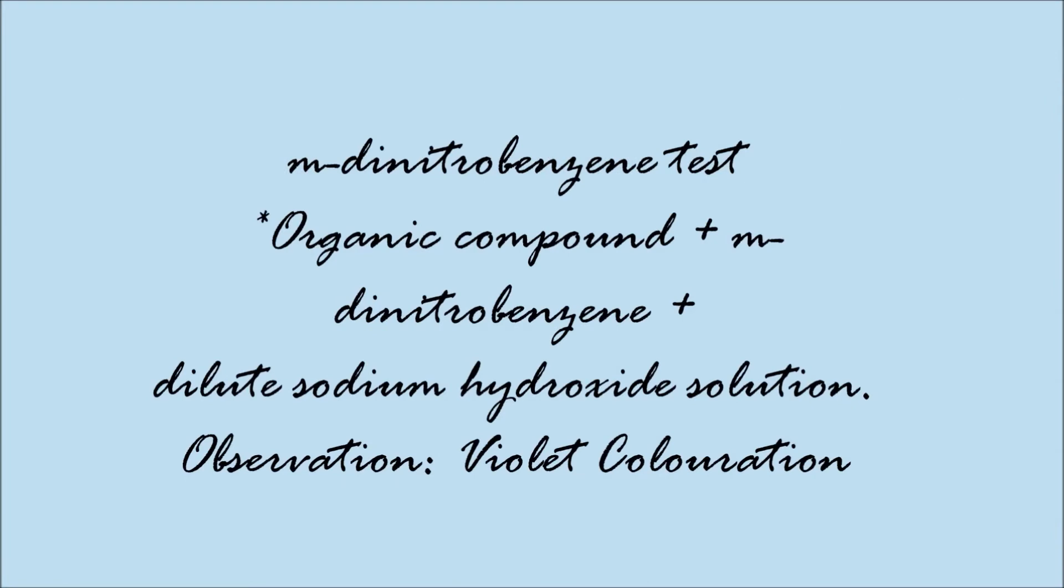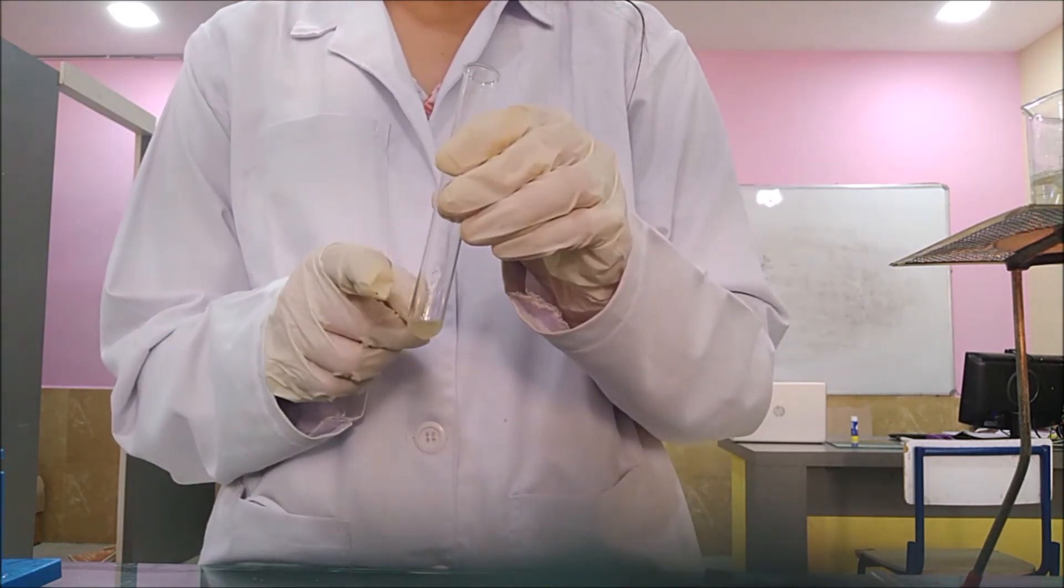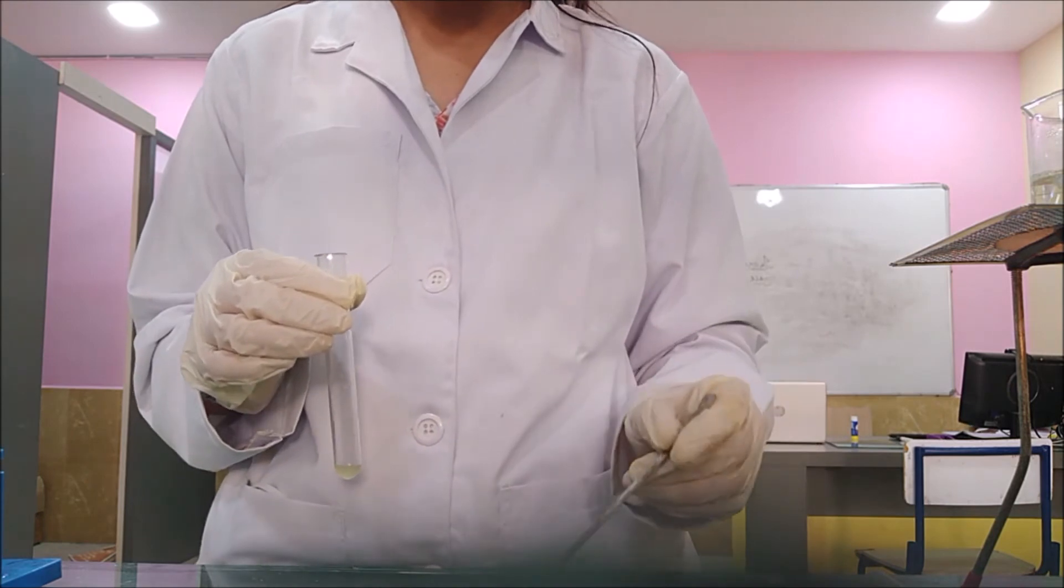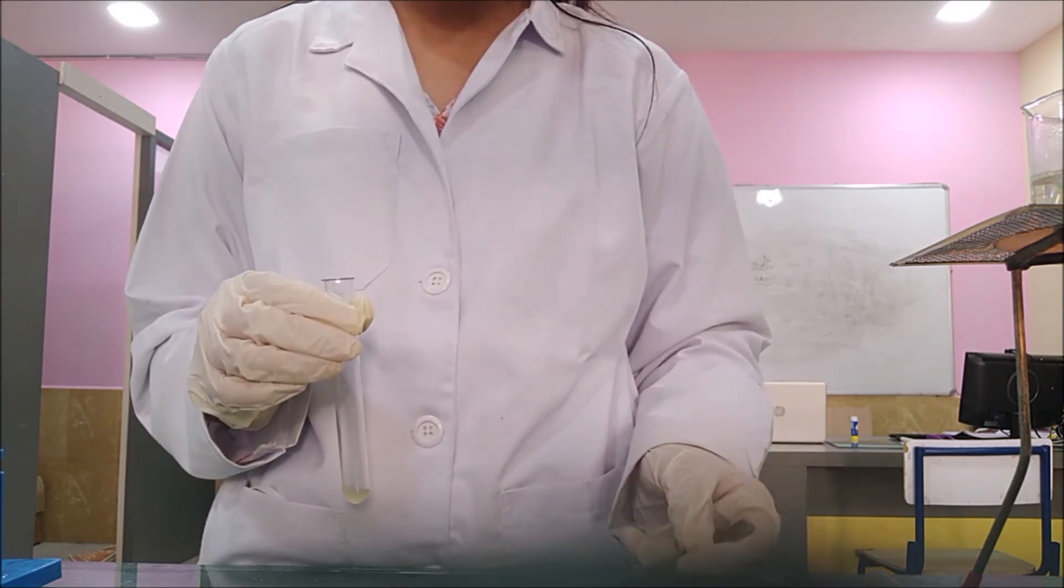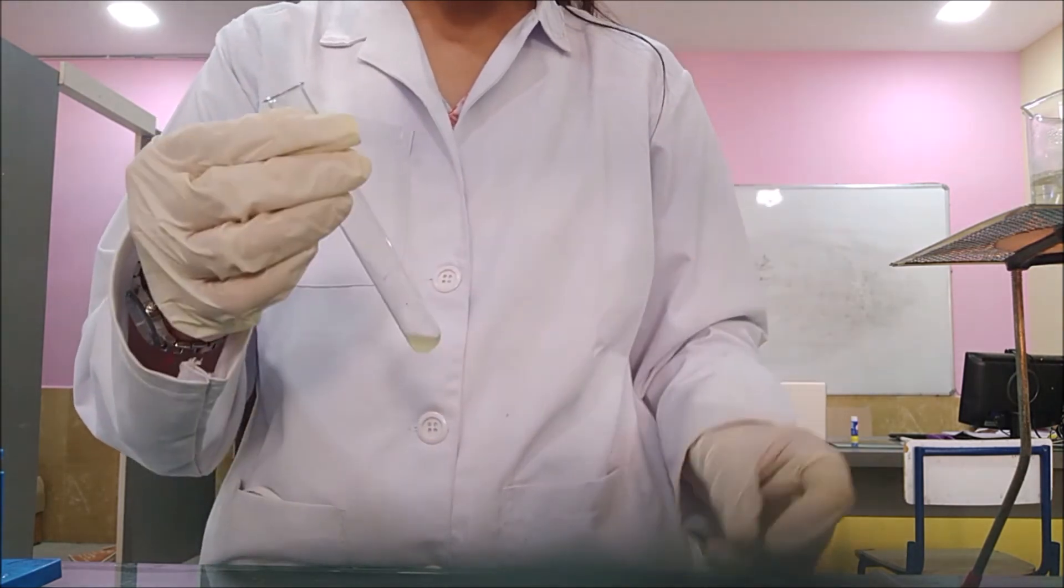Metadinitrobenzene Test Procedure. Take organic compound, around 1 ml. Then add a pinch of Metadinitrobenzene into it.